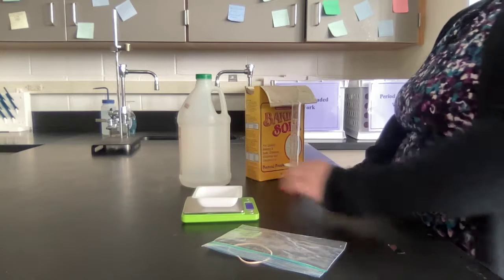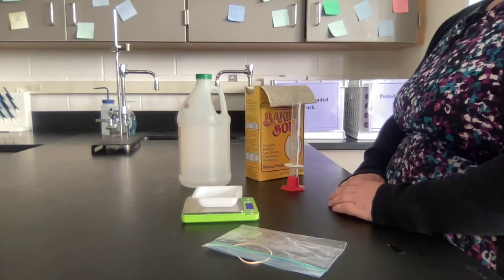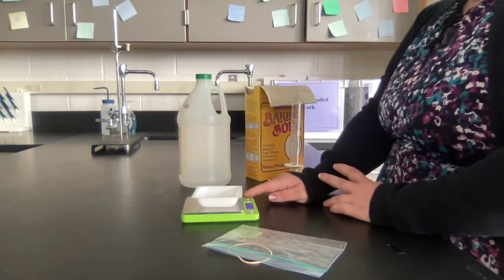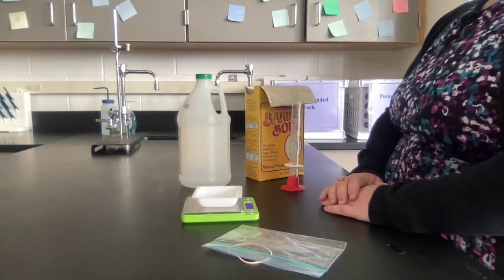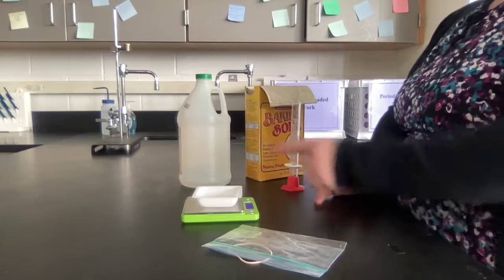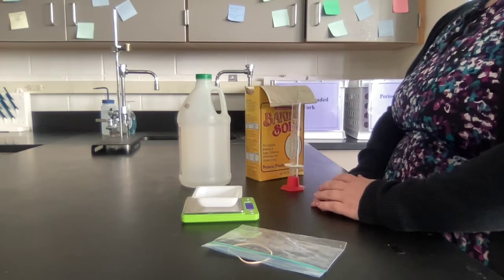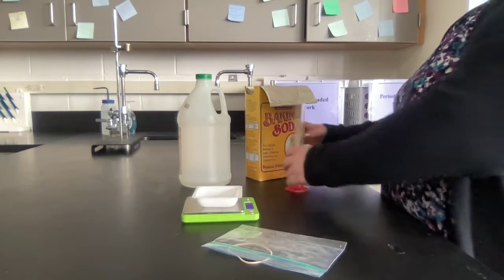Take your weigh boat, place it on your balance, make sure the balance is turned on, and then hit the T button which is all the way over to the right-hand side, and that's going to tare it. That means it will set it to zero with the weigh boat on there.